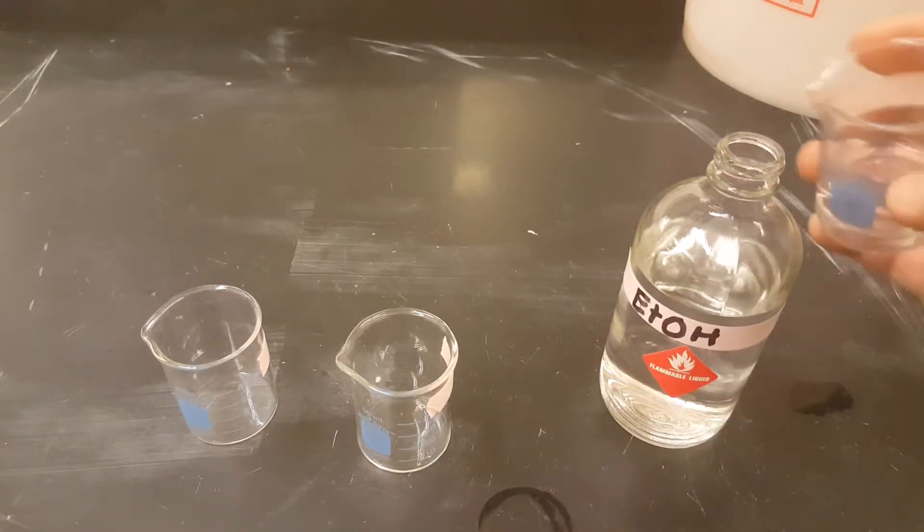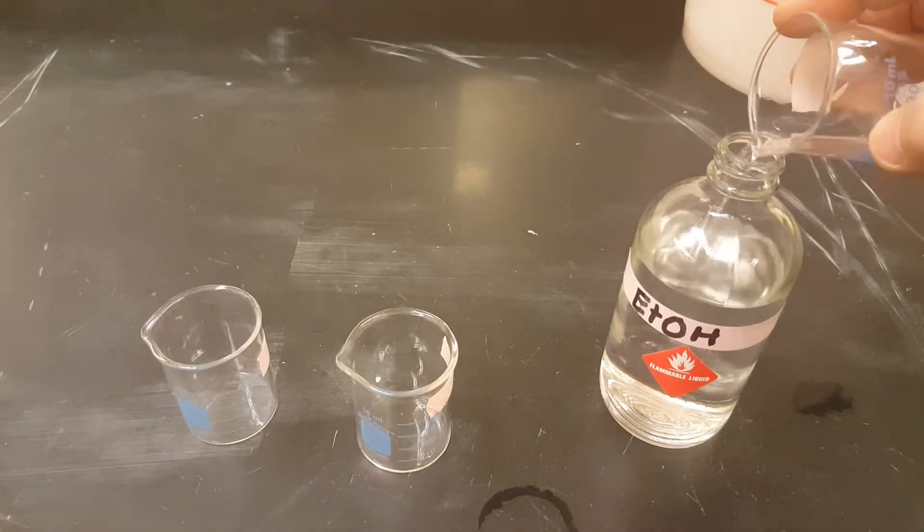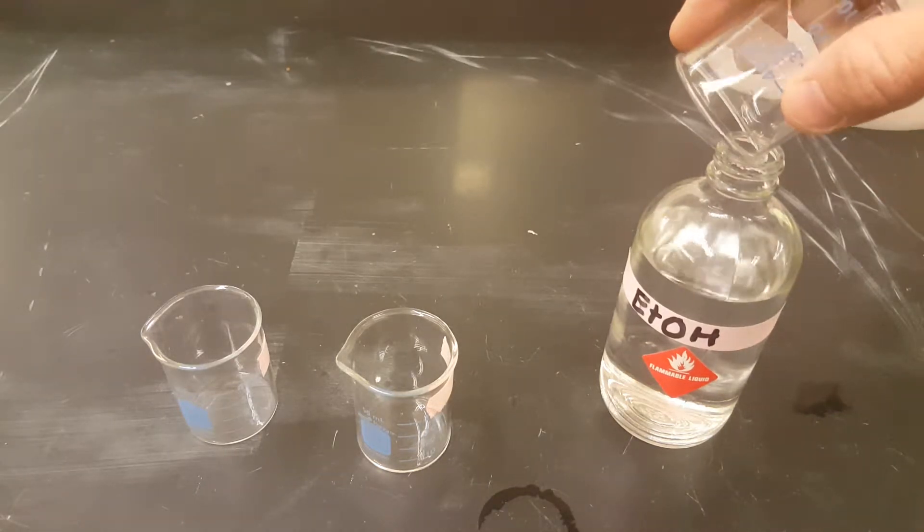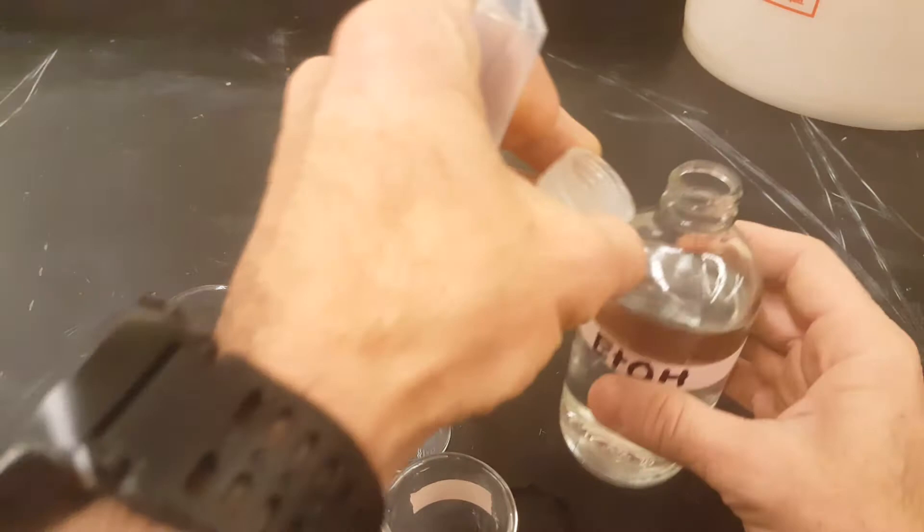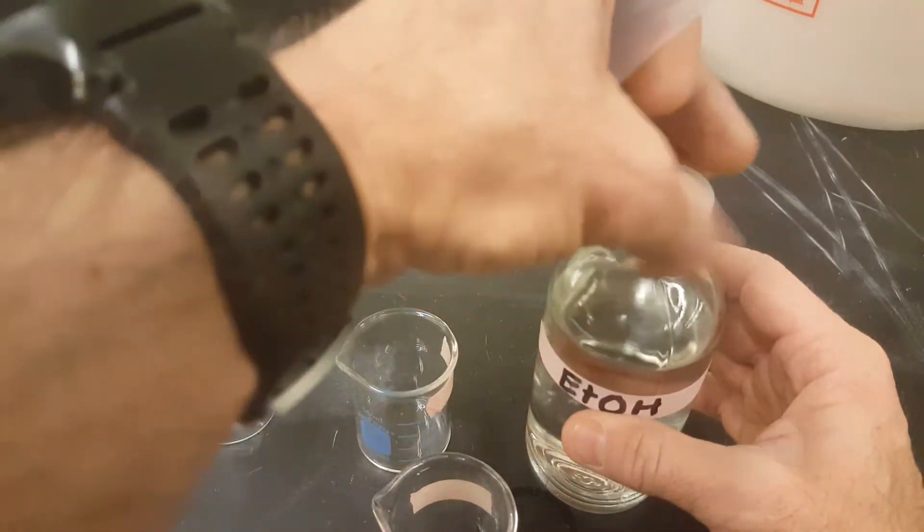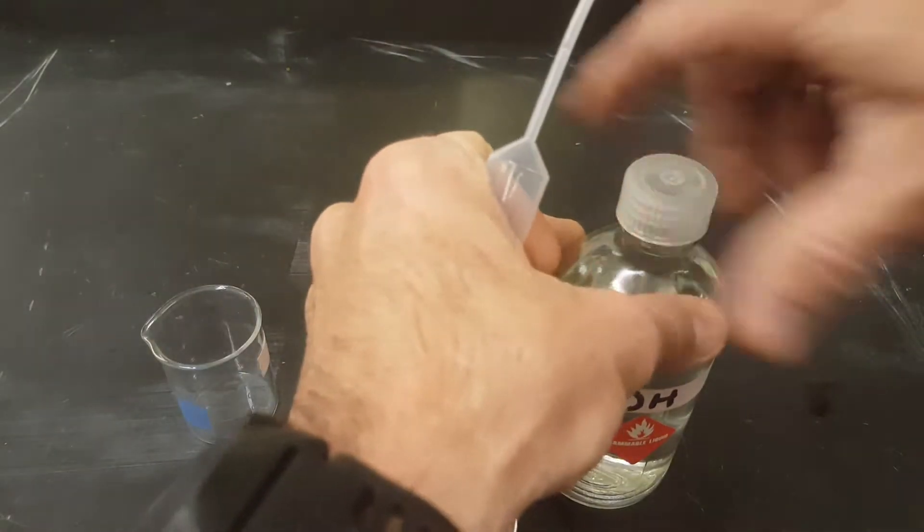When you're done at this station, like I just instructed you, pour everything back into the source bottle. Because it's so volatile, it'll evaporate so quickly, we don't want to waste any of it and put the top back on gracefully.